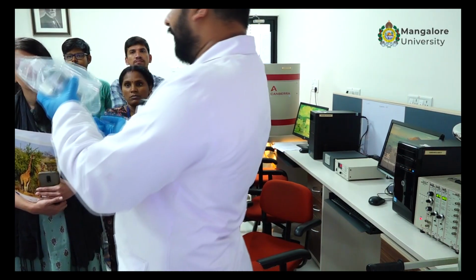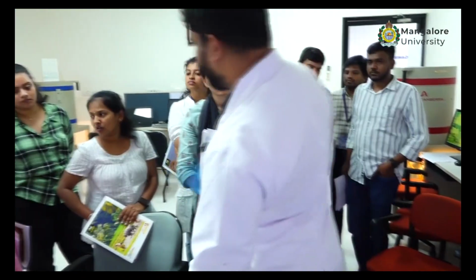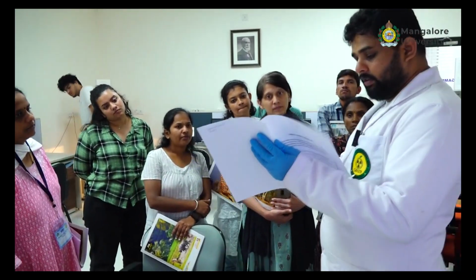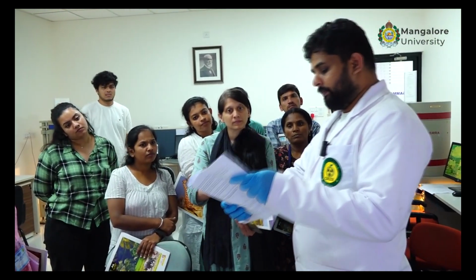So what if there is some leak here, it should get contained here. So I'll show you the report how it comes. So this is a sample, the paper that they mail us. So you can see that they have sent us instruction to participants.